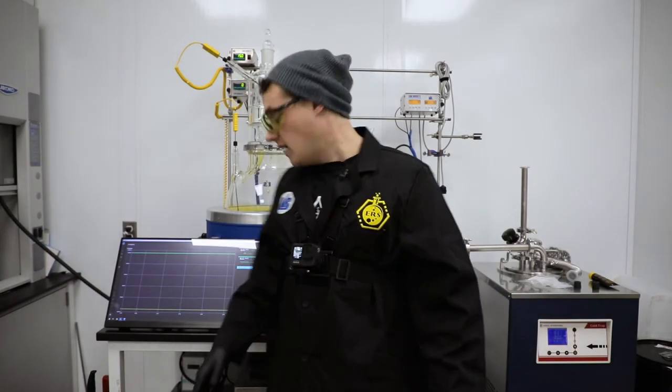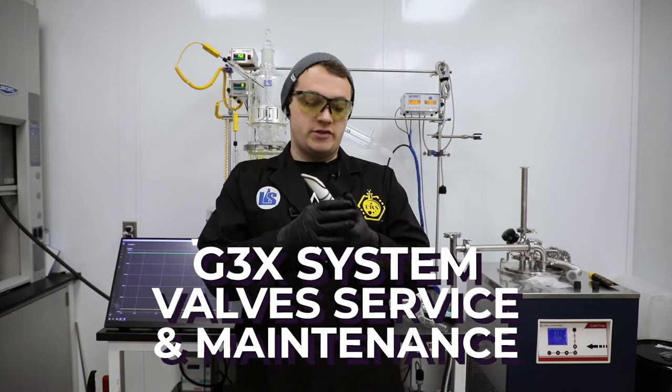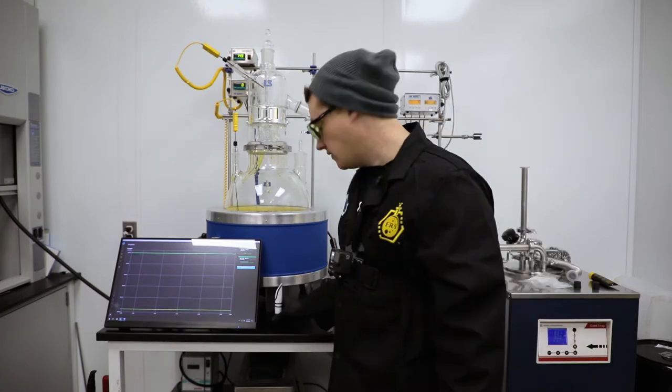Happy Wednesday! This is Mike here and I'm in the LabCity R&D Lab, and we're going to go over how to properly service and maintain these Flickit valves that we've been selling with our G3X systems.